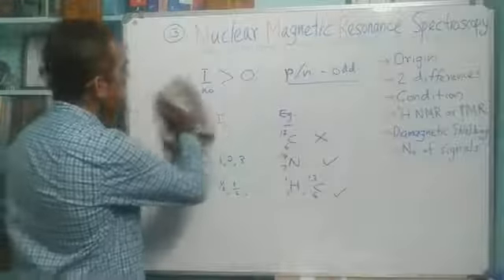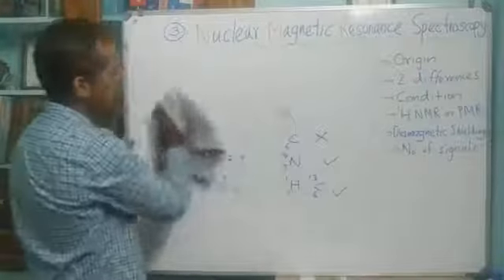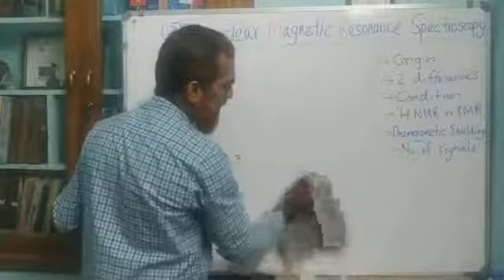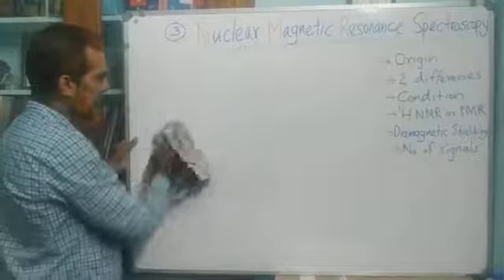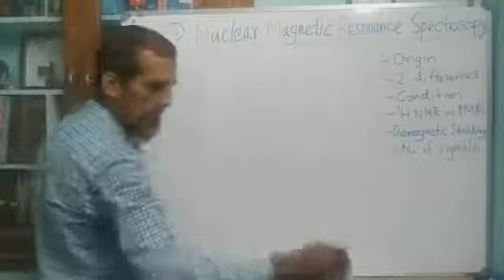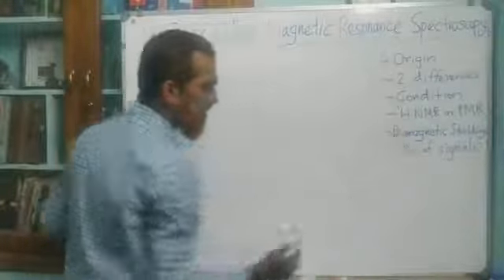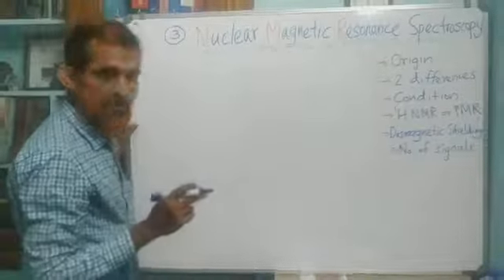Now, next, in our syllabus, here in the 6th semester, we are dealing with only NMR spectroscopy applicable to the hydrogen isotope, that is what we call H1 NMR. NMR is classified into various types based on the nuclei under consideration.